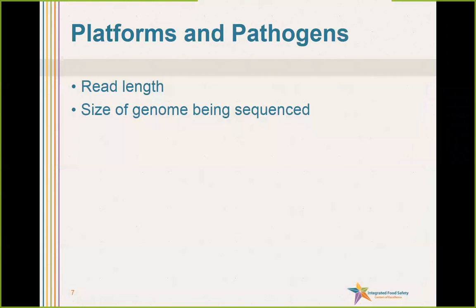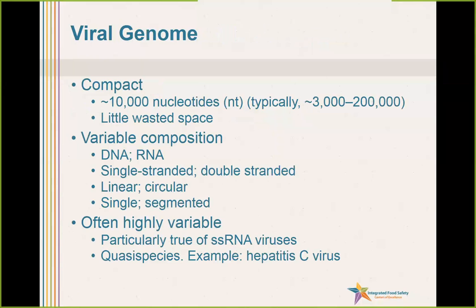Additional considerations for platforms are what pathogens are being sequenced. It's important to know the read length the platform can handle in relation to the size of the genome being sequenced. And I'm going to go into some specifics on various genomes.